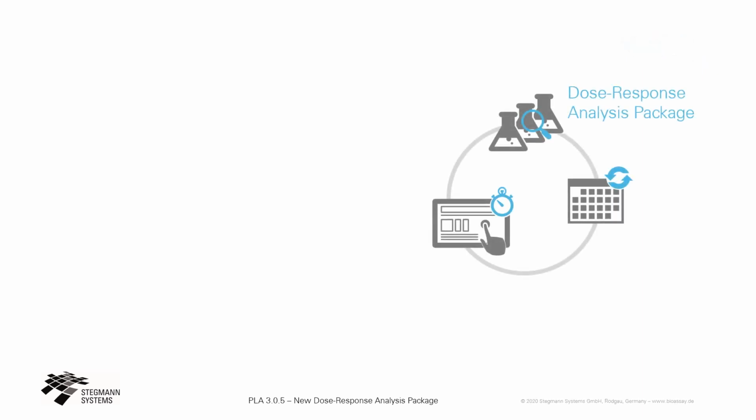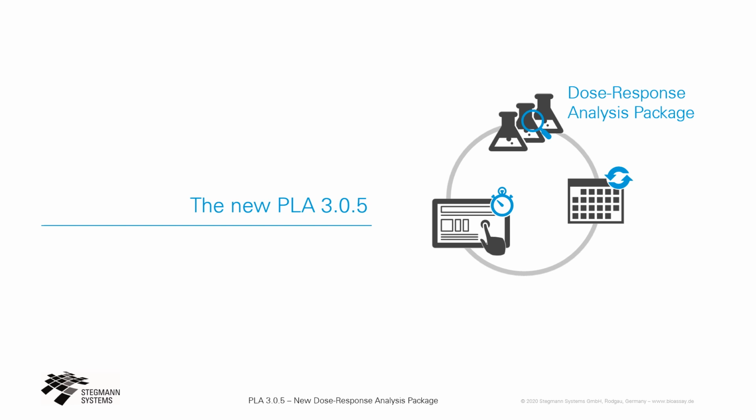The new dose response analysis package is part of the new PLA version, PLA 3.0.5. The PLA platform itself now has a new add-on management which keeps you always up to date and provides an easy way to access software extensions. And customers who already work with PLA will notice numerous improvements that enhance usability and performance.